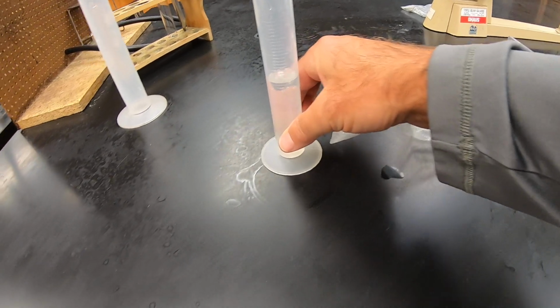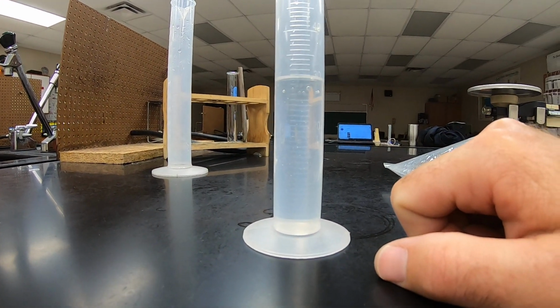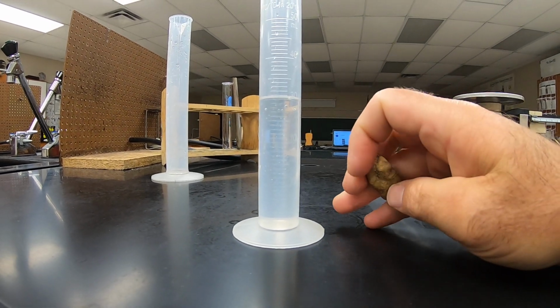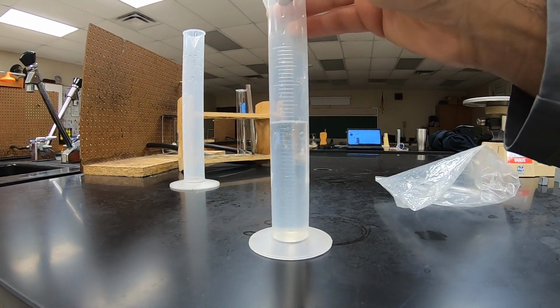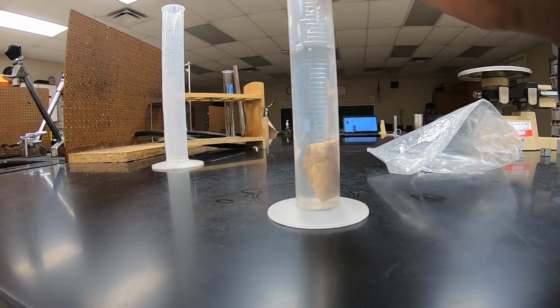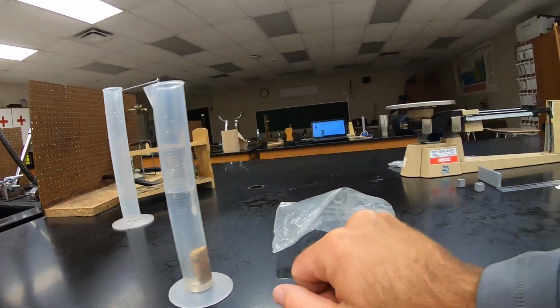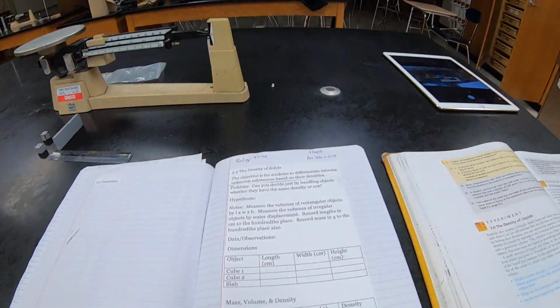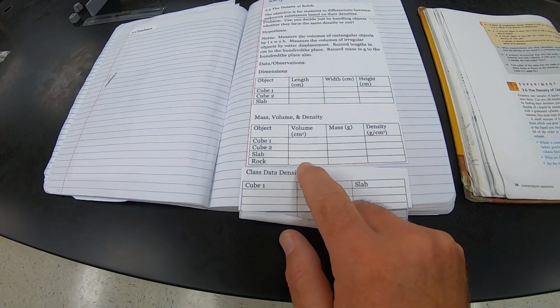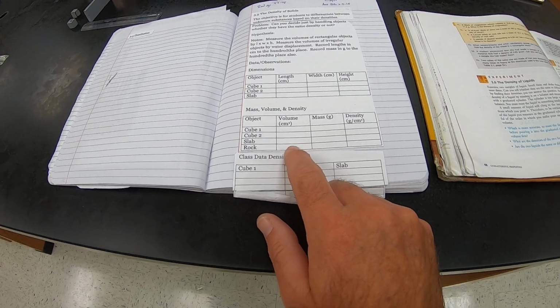So I've already got a graduated cylinder with about 30 cubic centimeters, 30 milliliters of water in it. We're going to slide the rock in so it doesn't splash. And it goes up to 34. So the volume of the rock is 34 minus 30, which is 4 cubic centimeters.